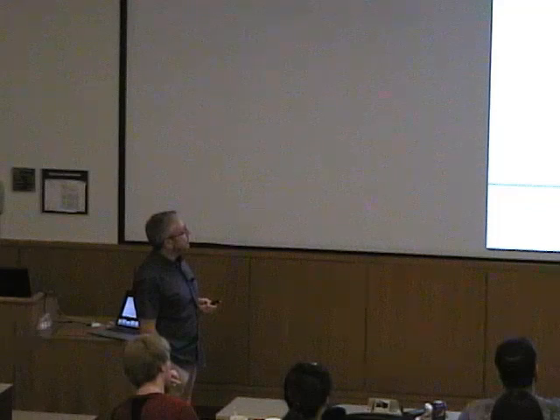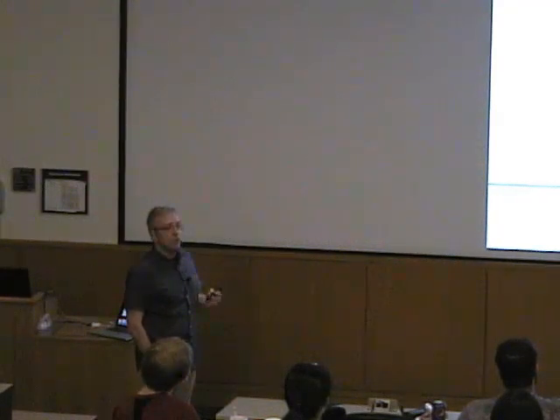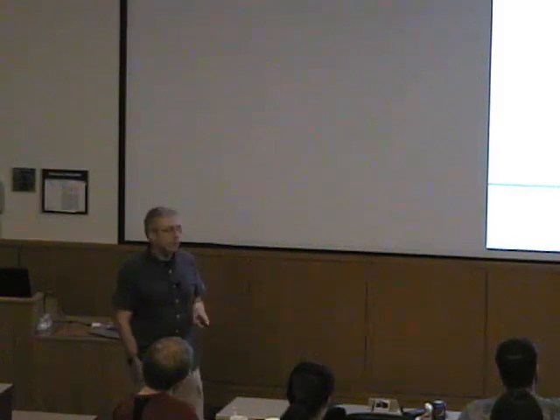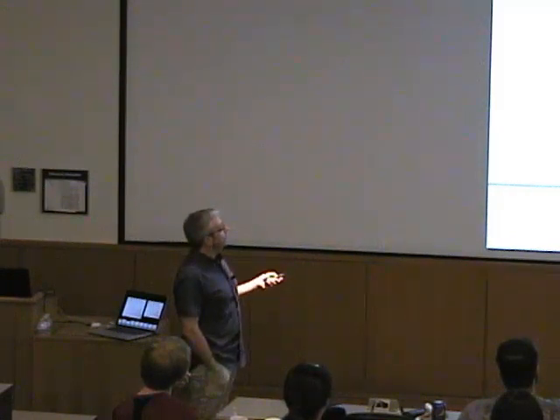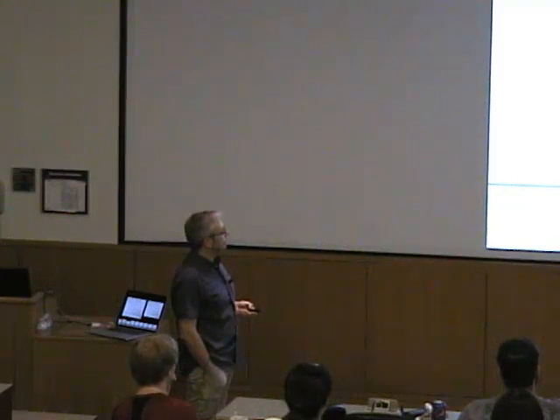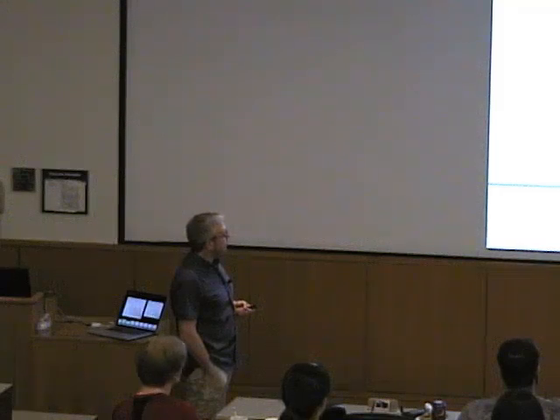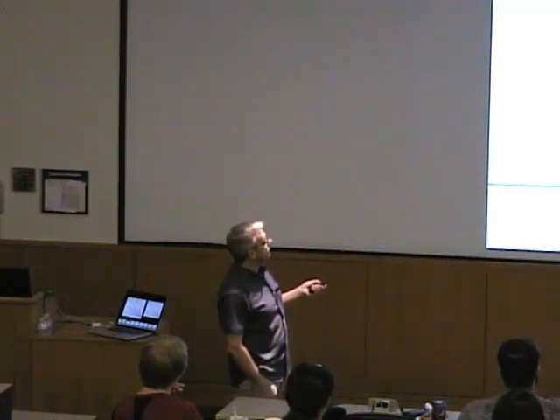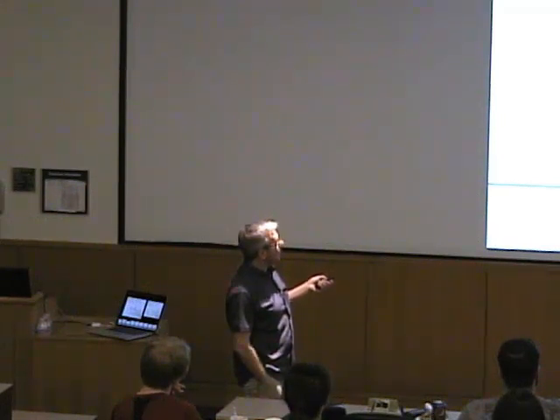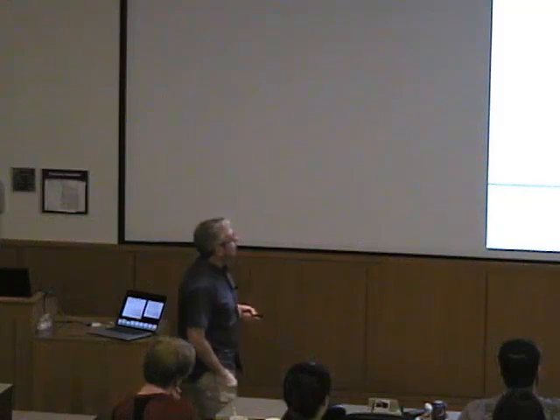And again, we have this ambiguity here that the phase angle is unknown, but we know that all three together give you this phase triangle, and that phase triangle is actually only fulfilled where those two circles intersect. So only here and here we would actually fulfill this phase triangle, which means that the unknown phase for FP, which we are looking for, must be essentially one of these two.